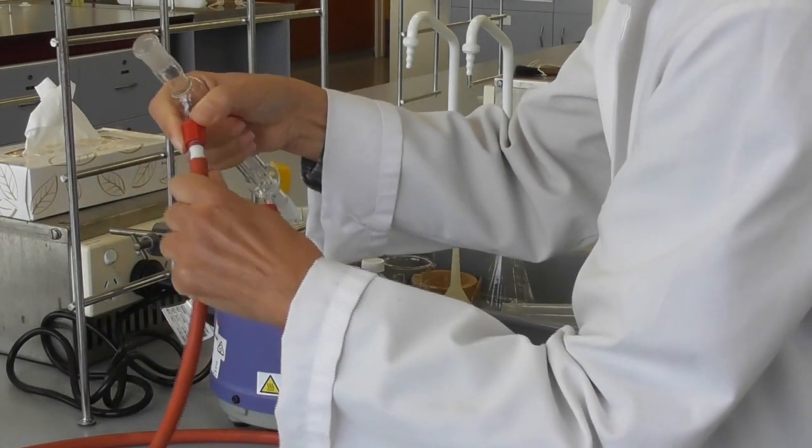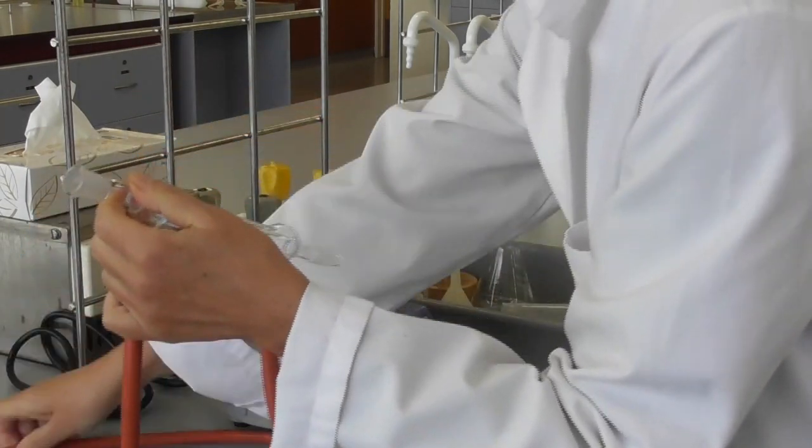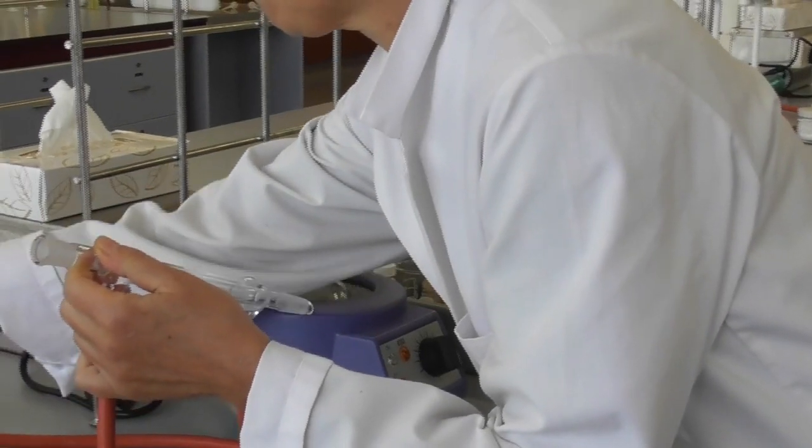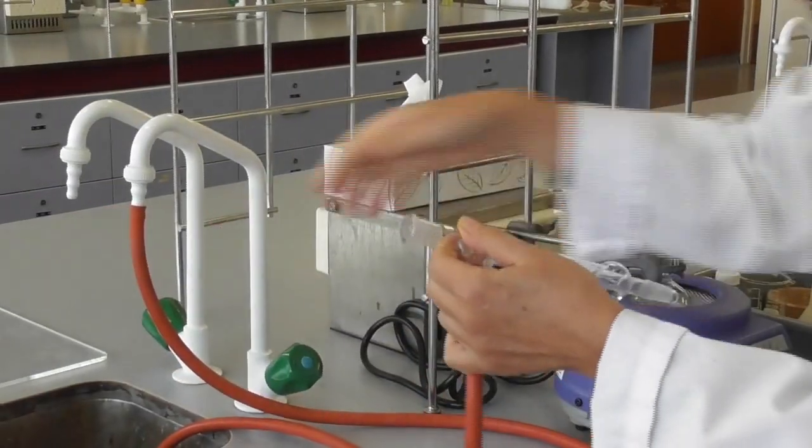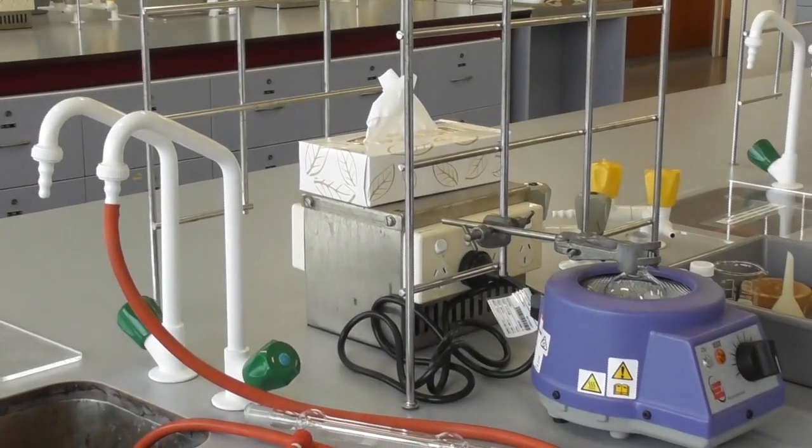Next, we take the condenser and attach the water hoses. The incoming hose gets attached to the bottom of the condenser; the top one is the outlet.